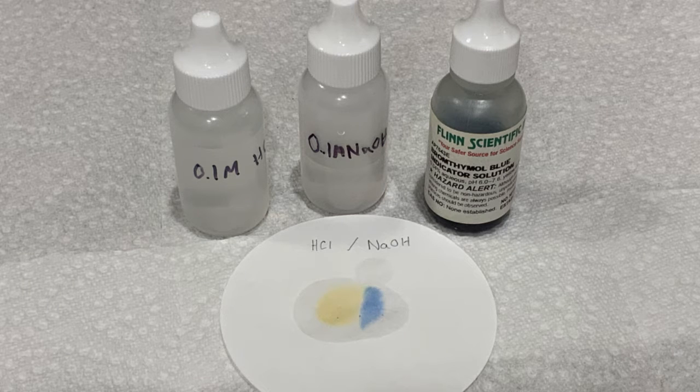We are going to take a look at an acid-base reaction, and we're going to look at the effect of an indicator on an acid and a base. The indicator we're using today is called bromothymol-blue. It changes color depending on whether the solution is acidic or basic. And so we're going to look at hydrochloric acid, that's our acid, and sodium hydroxide, that's our base.